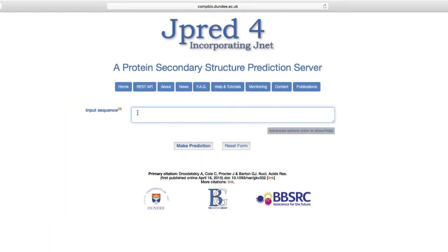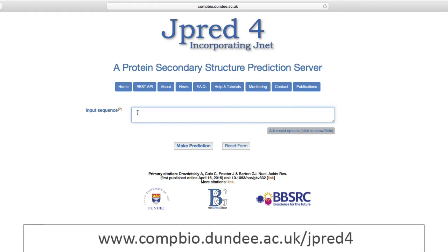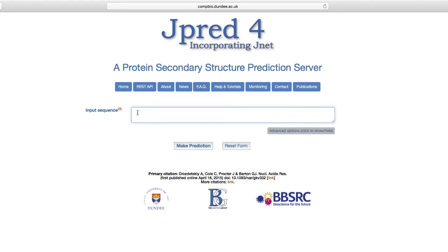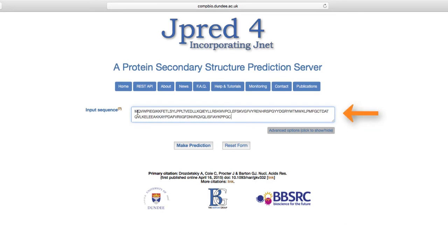The JPRED4 website can be accessed using the URL on the screen. The simplest way to run JPRED4 is to paste the protein sequence into the input sequence field on the homepage and click the Make Prediction button. Note, multiple sequence alignments cannot be entered using this route.